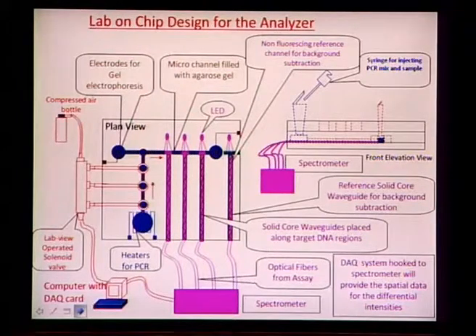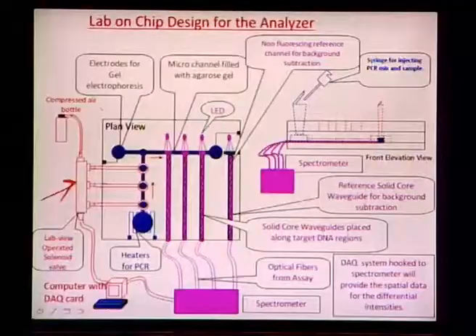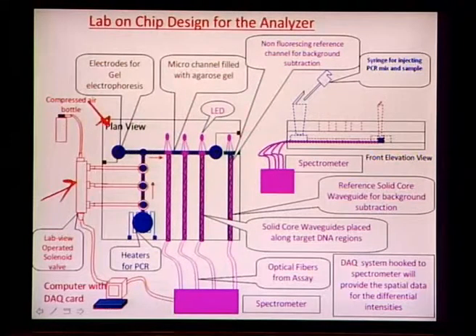Our purpose here as engineers was to design an assay where all these different protocols, which can be done within the molecular biology laboratory, can be integrated onto a similar chip, and that is exactly what we did here. This is about a 2 inch by 2 inch silicon wafer, in plan view. There are channels made in PDMS and pasted on top of it using clean bonding protocols. This is the small PCR chamber sitting over embedded heaters in the silicon chip, which are made by liftoff and deposition processes.